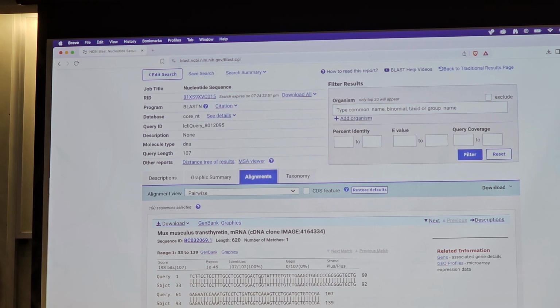Where's your mismatch? Somewhere over here? In here? Oh, down here. Okay, so if you go to your trace, you could look there to see maybe why there's a problem. That might be in a region where the dideoxynucleotides came out. I'll show that in a second.